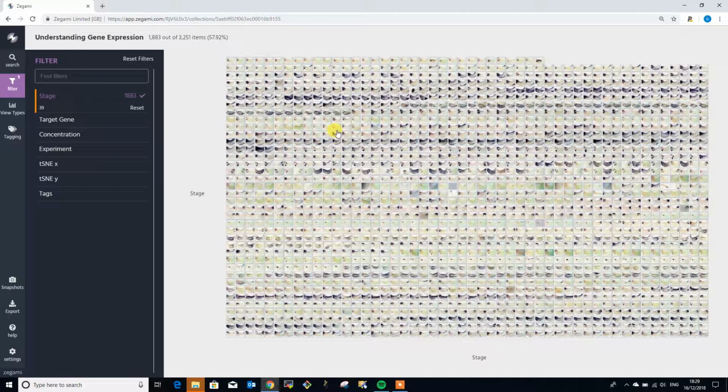concentration of a particular gene can be altered using a blocking agent called a morpholino. And we have these concentrations logged, so these experiments have been done at various concentrations on various different genes to understand how much concentration of morpholino we need to be able to block those genes.